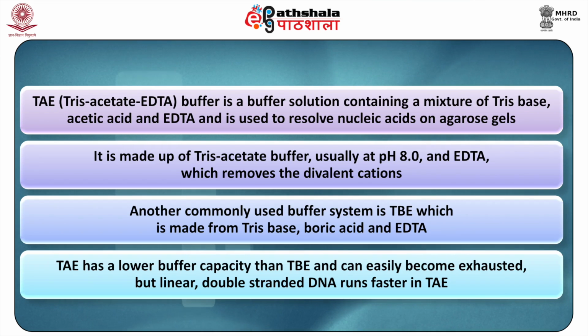TAE, that is Tris-acetate-EDTA buffer, is a buffer solution containing a mixture of Tris base, acetic acid and EDTA, and is used to resolve nucleic acids on agarose gels. It is made up of Tris-acetate buffer, usually at a pH of 8, and EDTA, which removes the divalent cations. Another commonly used buffer system is TBE, which is made from Tris base, boric acid and EDTA.